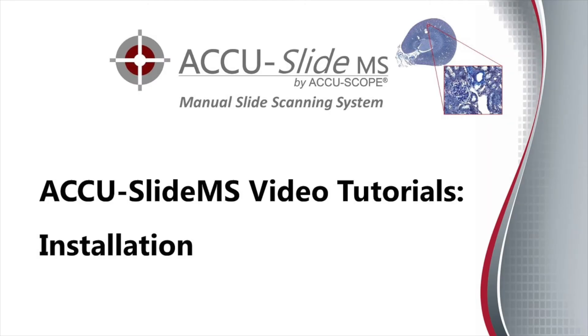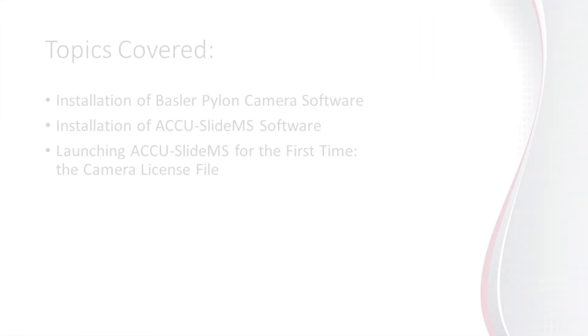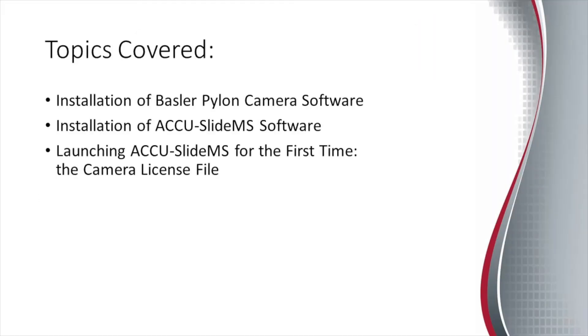Welcome to the AccuSlide MS video tutorials. This tutorial covers the installation process. The following topics will be covered in this tutorial.